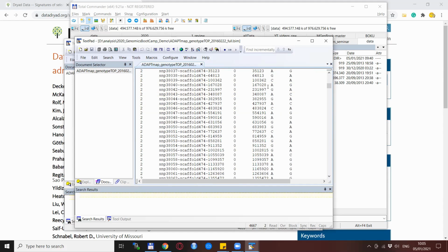The nucleotides here show what the genotypes of the SNPs located on the genome are. So this is, for example, an AG SNP or a CA SNP and so on. Also from this BIM file, we see that the genotypes are in a nucleotide coding, so not numerical and not AB coding.